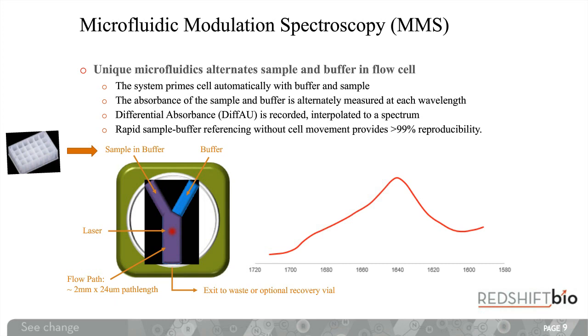We also, by using this modulation between the two channels, account for any short-term drift there might be within the light source, which is again quite a large problem with FTIR, as during the course of what can be quite a long measurement, you can actually have quite significant drift in the light source, and this can cause quite large errors in the spectrum.